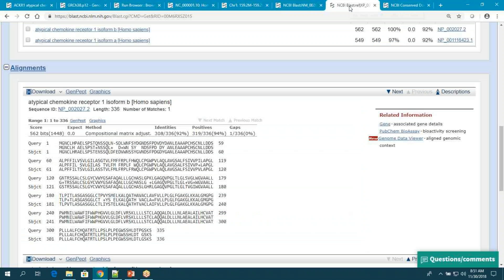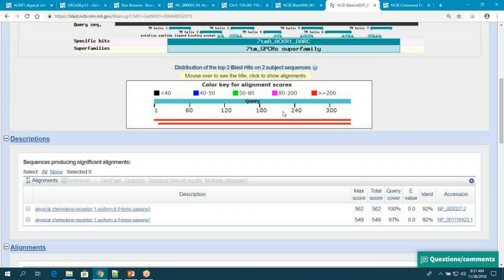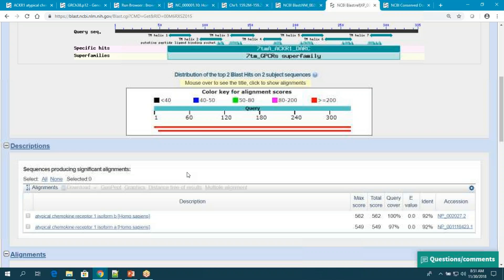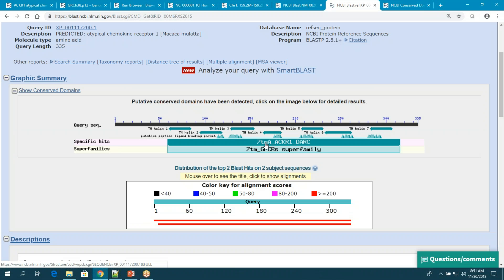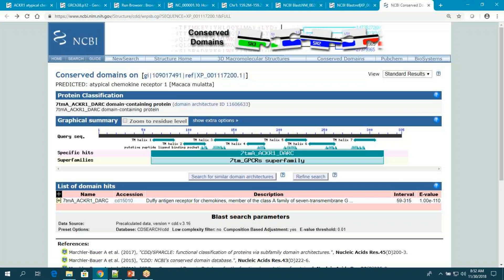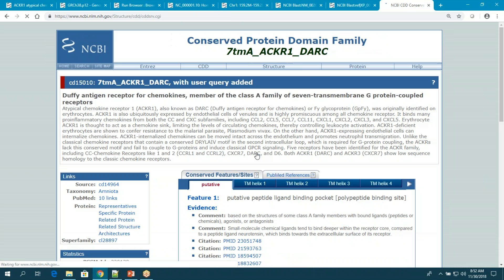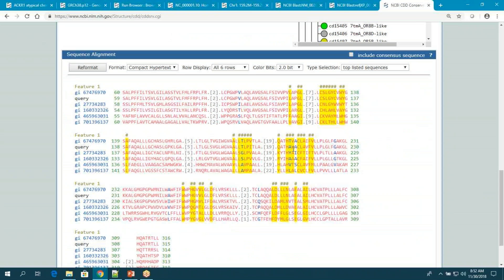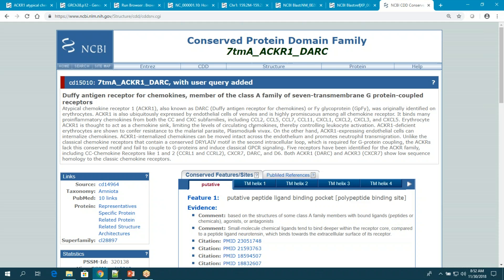I can see how the rhesus macaque protein sequence compares to the human one. These are XP accessions — based on next-gen alignment, these are preliminary gene model sequences. I ran a BLAST limiting results to human, and found the two isoforms of the human chemokine receptor. There's a link to a conserved domain, and going through to the conserved domain multiple sequence alignment, it highlights residues important in peptide binding and describes what this domain does — it's a promiscuous binder of cytokines.